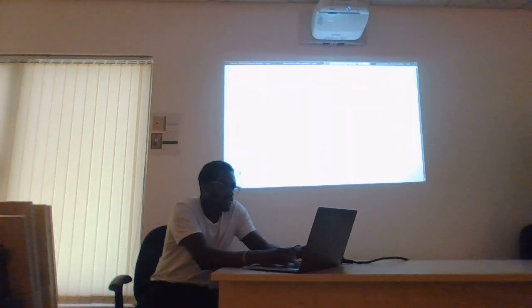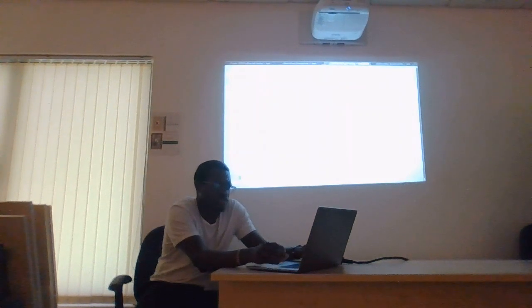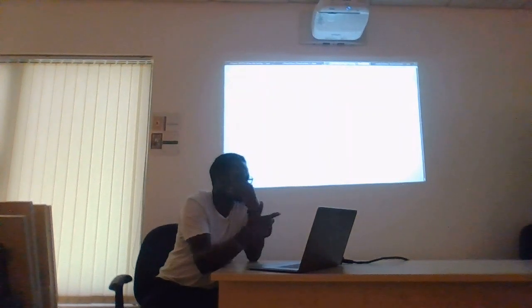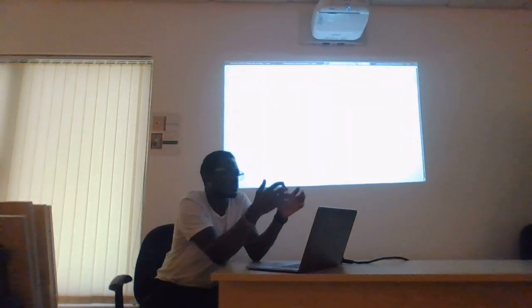And the next one is output. What's the nature of the path of the channel? So Salmon will create an index, but what would be the output of that index? It will have several files, but we want this to be a path. Yeah. Right?